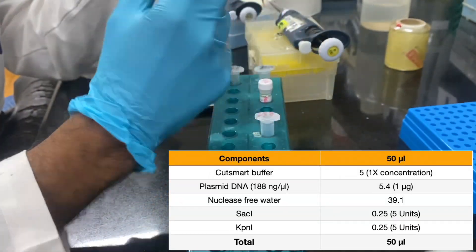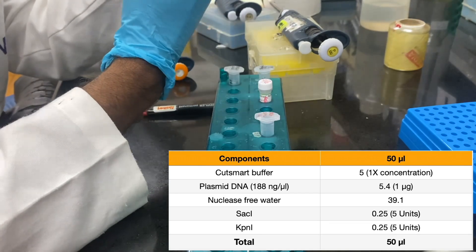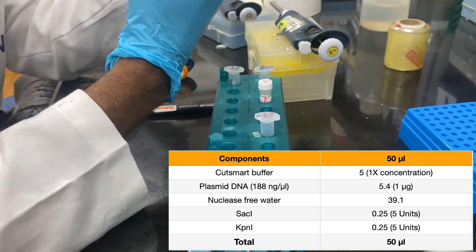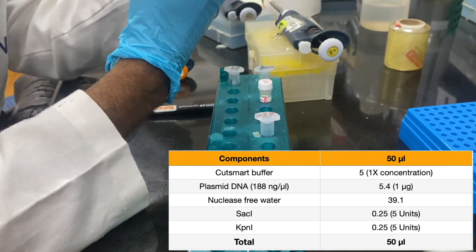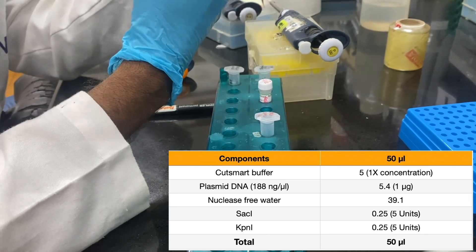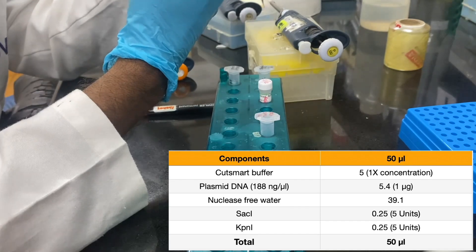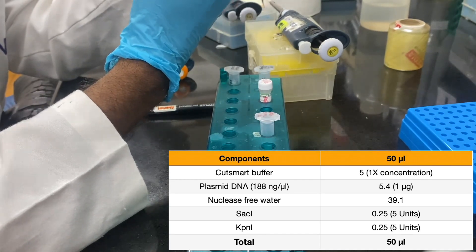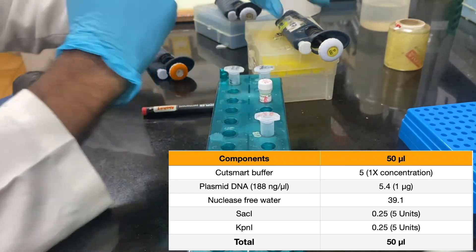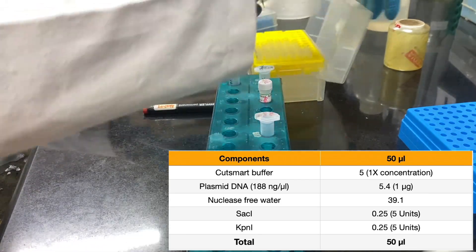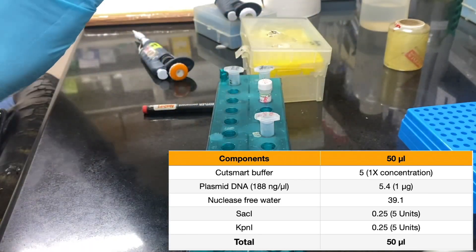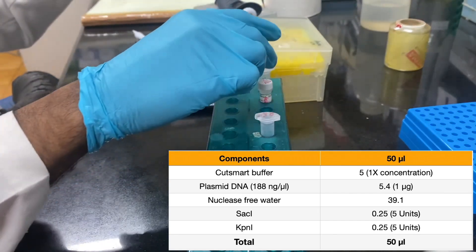We will start setting up the reaction. Today we are going to set up a 50 microliter reaction in which we are digesting one microgram of our recombinant plasmid DNA by using five units of KPN1 and Sac1 restriction endonucleases. First we will add the nuclease-free water. Calculations you can see on my screen.